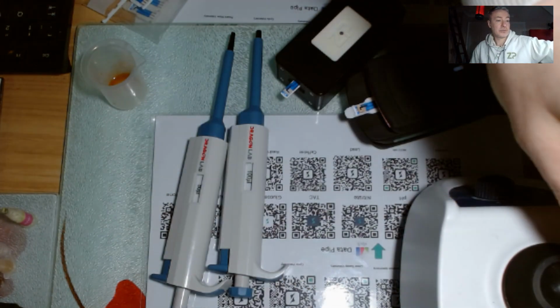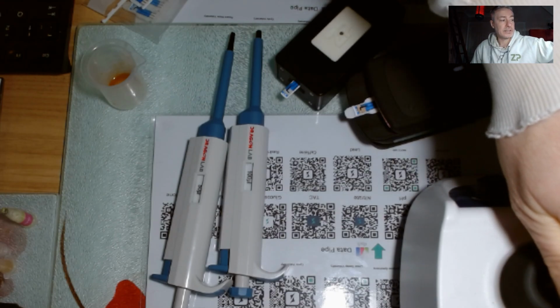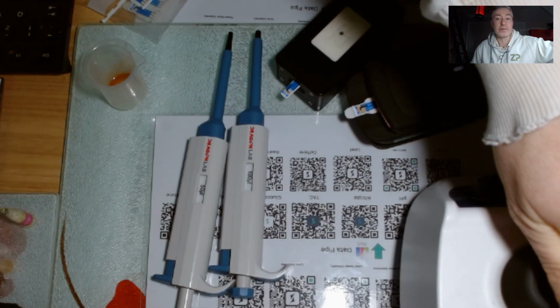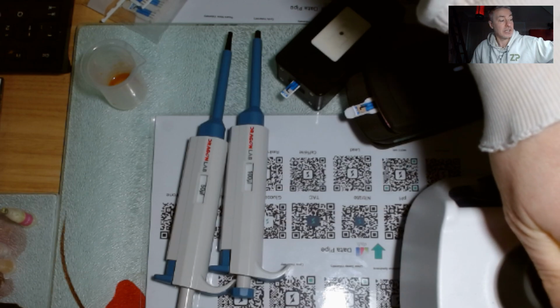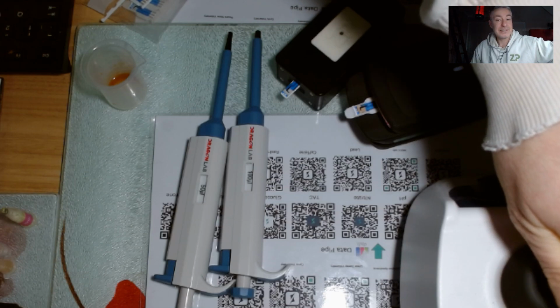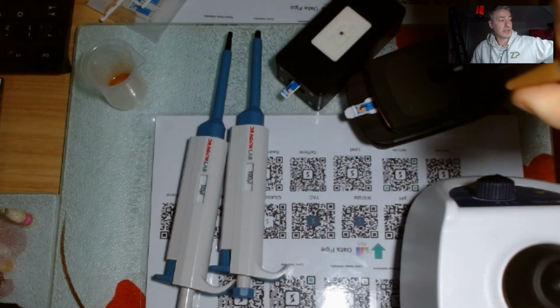I'm just going to give it a quick vortex. It's very important. Vortex, I find, is by far the best way of extracting either ginger samples or chili samples or tea samples. We have all sorts of samples that we analyze these days. I'm just going to give that a quick vortex.